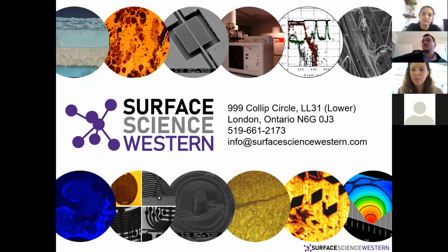And I see this issue a lot when people curve fit the oxygen peak. They get focused on, well, I'm interested in chromium oxide and chromium hydroxide. So you take your chromium 2P and your oxygen 1S, and you say, okay, I see chromium hydroxide and chromium oxide, therefore all my oxygen peak is just chromium oxide and chromium hydroxide. But they don't take into account that there's an overlay of carbon with oxygen associated with it. They don't take into account that I've also got some silicon oxide mixed into that material, some sulfate, some this and that. They don't realize that all those oxygen species are also in that oxygen 1S spectrum. They get focused on just the one element, and they forget about all the other stuff that's contributing to that spectrum.